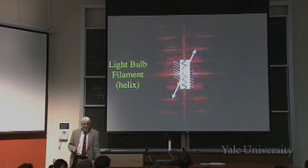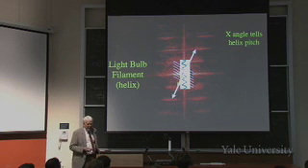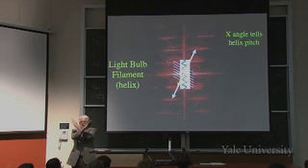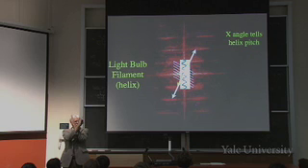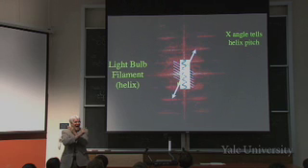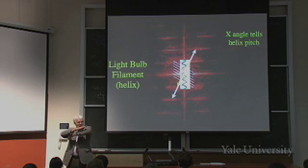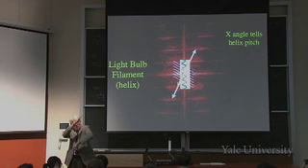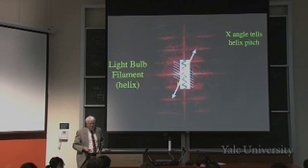And you can do the same trick in the other direction, right? So that's why it's an X. You can draw these analogous mirror image lines. Okay, now what does the angle of the X tell you? The X could look like this, or it could look like this. What do you learn from that? The angle that the X makes tells you how tightly wound the helix is, because if the helix were very tight, then the planes would be like this. And if you grabbed the spring and stretched it out, they'd look like this. So the angle of the X tells the pitch of the helix.